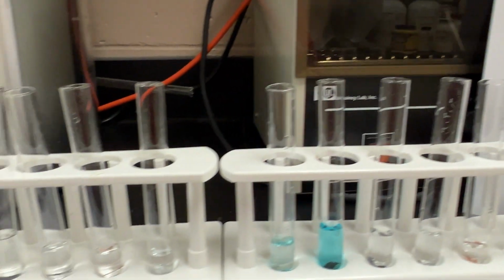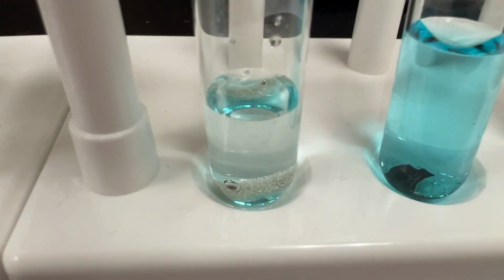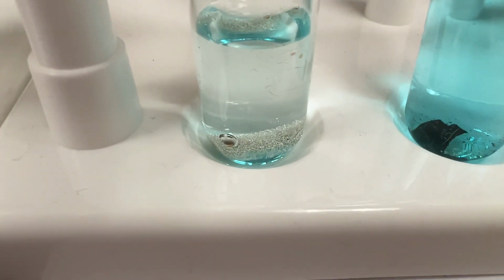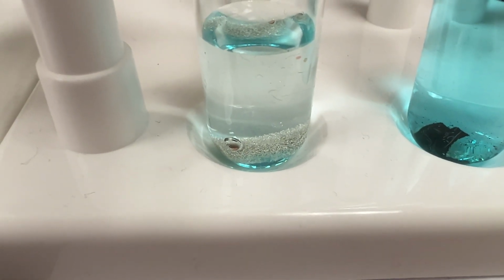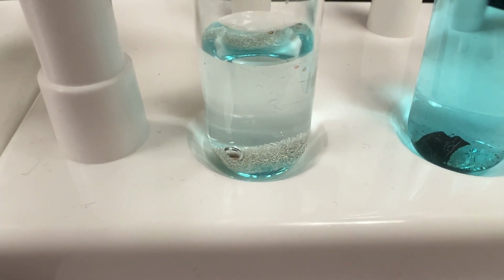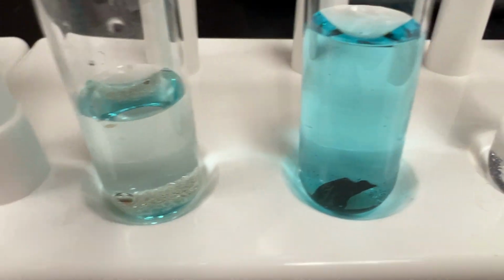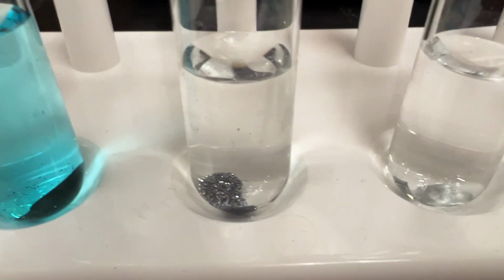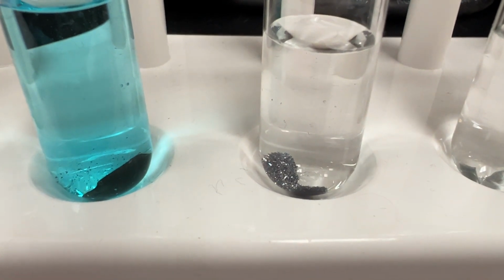So I just want to peek back here at that silver nitrate. You can see those crystals are very beautiful, and that solution really has taken on a blue color. Remember, it was originally clear. It was copper in silver nitrate. And I would like to just pop back to the lead, because that's also one of my favorites. It's so sparkly and pretty.